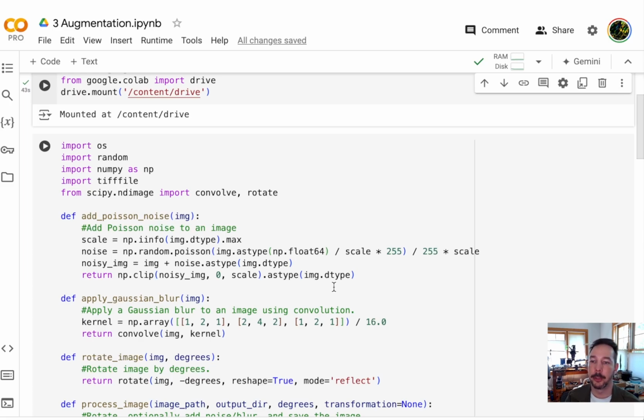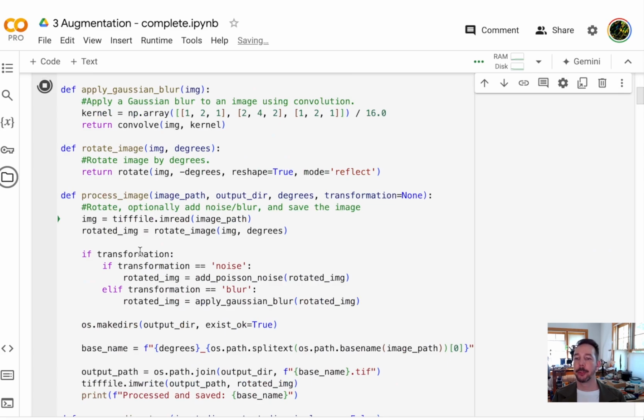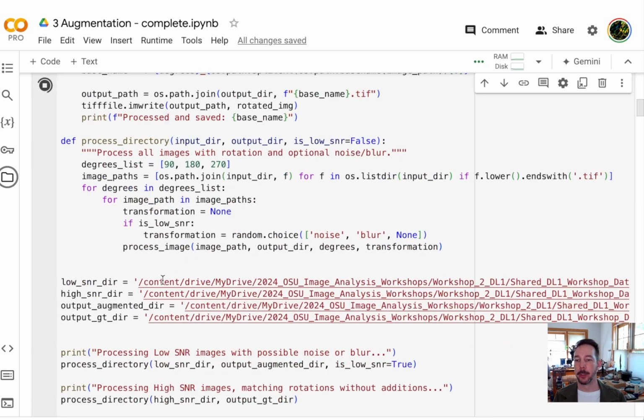Some classic examples are to add shot noise to the image to reflect noisier conditions when imaging, or Gaussian blurring, maybe if the objective is a little bit dirty or the imaging conditions are a bit poorer. Then the model also learns that when it sees a data set that's more blurry, it can still restore to this nice high contrast image. And the way to do that is to use augmentation code. What this code will do is basically create these augmented images for us.